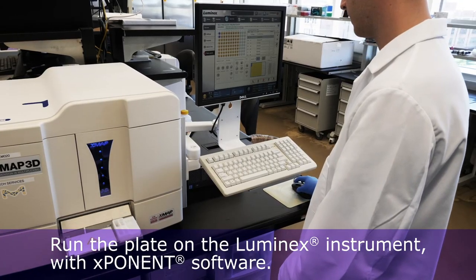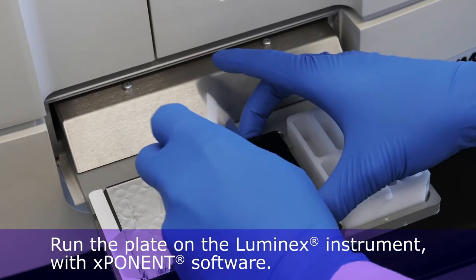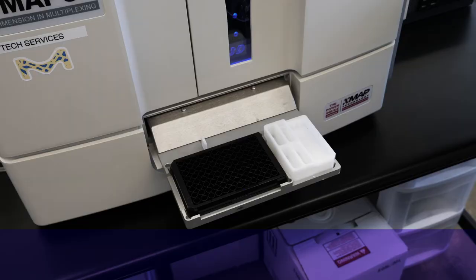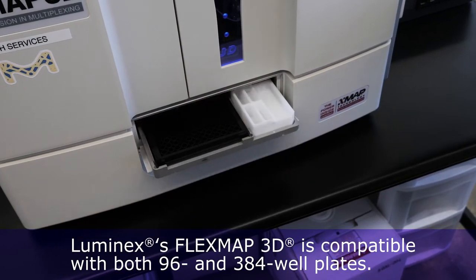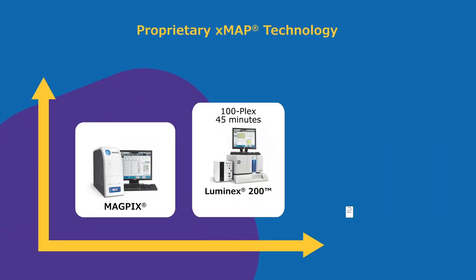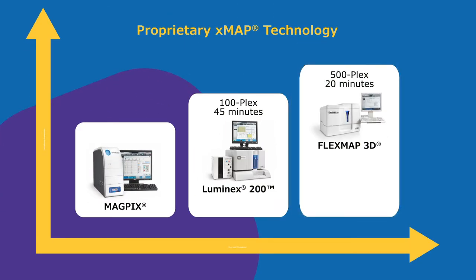Run the plate on the Luminex instrument with xPONENT software. Luminex's FlexMap 3D has a fast read time and compatibility with both 96 and 384 well plates. The Luminex 200 and FlexMap 3D have high throughput capabilities, compatible with higher throughput applications.